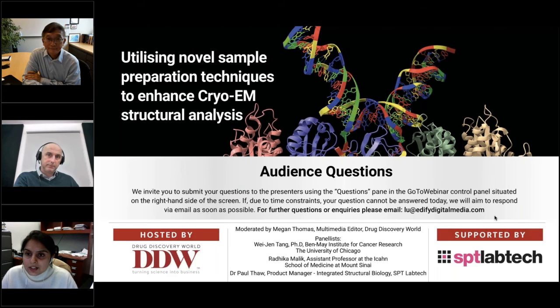So chameleon actually, I would say, is a better approach to use, if your sample can go to that concentration where chameleon wants it to be. I think that's the best approach. But yeah, sample is very key, and those are my inputs.